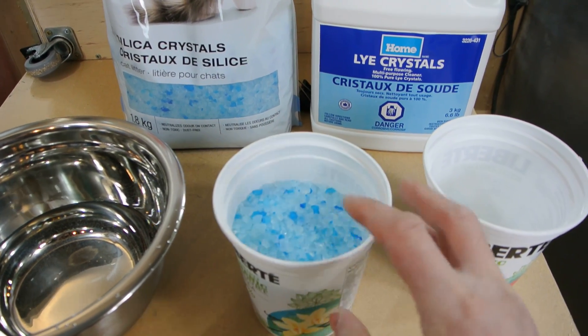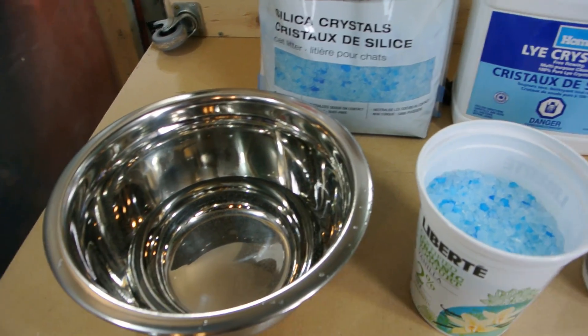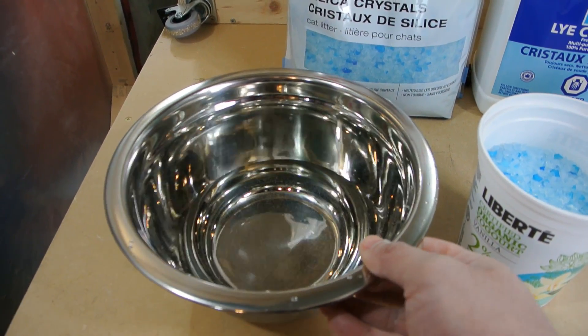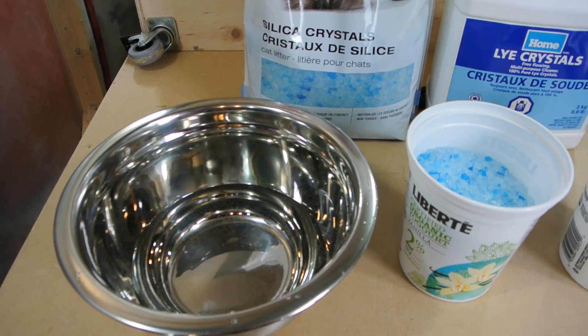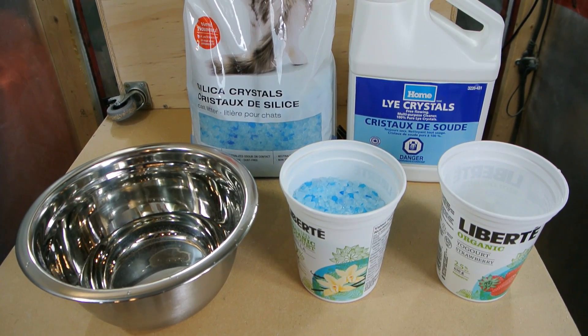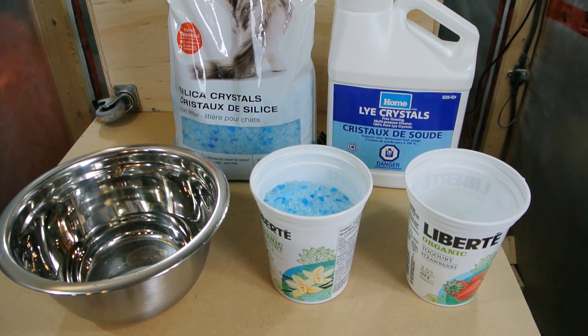All these ingredients are fairly cheap. What I've done is measured out 200 grams of lye, 300 grams of silica crystals - apparently the color doesn't make a difference, it just might make the water glass come out a slightly different color - and 500 milliliters of water. I'm using cold water. You want to do this in a ventilated area with some eye protection, and maybe even a respirator if you're not in a very well ventilated area.